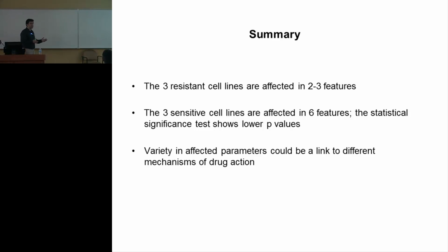So they're treated, they don't change, so we know that we can say they're not affected. But also what is good about that, if we have a list of changes we can study in different cells that respond to treatment, different subsets affected, that would allow us to study different mechanisms of drug action. So we can actually dissect how exactly the drug affected the cell.